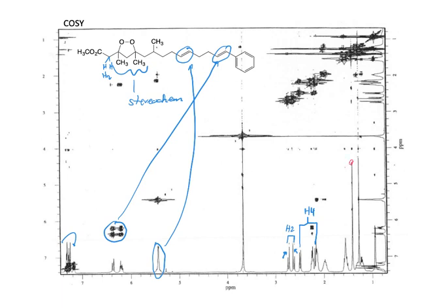Here are the 2 methyl groups. All right, those are those 2. Just the 2 methyl singlets.